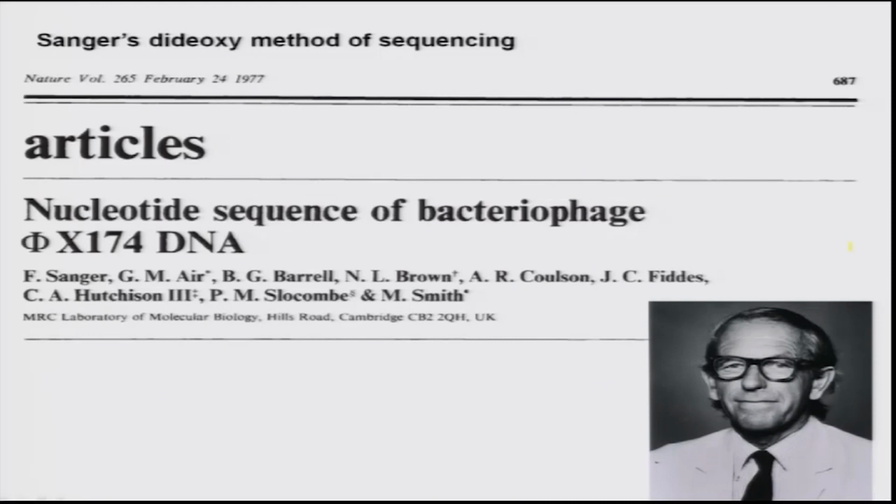So what is unique in that? He chemically modified the base such that if that base gets added, the polymerase will not be able to continue the polymerization. In other words, you terminate the polymerization. These bases are added in a smaller amount, therefore you have a normal base with a small amount of this modified base which terminates, and as a result you would not terminate the polymerization at every point, but at certain points. That is what the method was, and in fact he was awarded the Nobel Prize for this particular invention, because it has really changed the way the DNA has been sequenced.